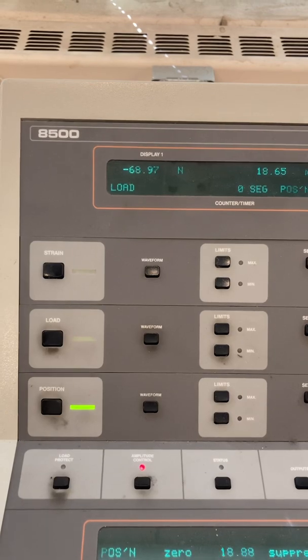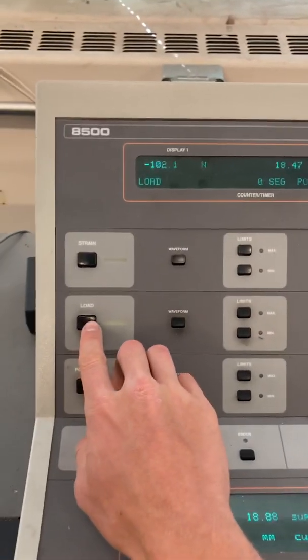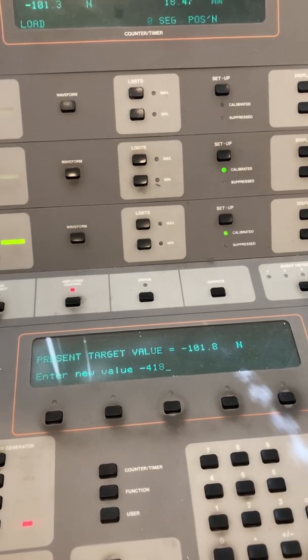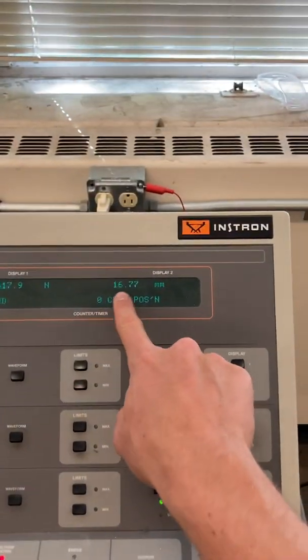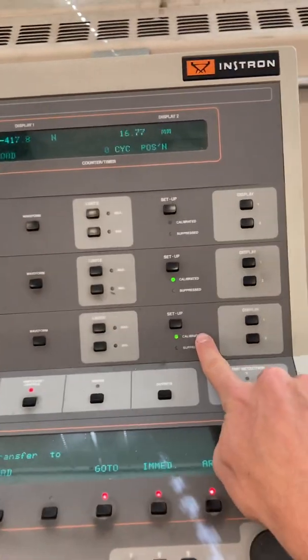I'm going to load it to maybe about 100, and then go to 418. Then we can go to negative 418 — it should jump to 418 eventually, so this deflected. Now we're at our mean load.